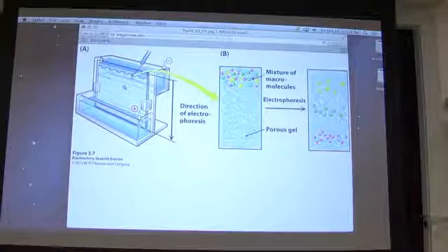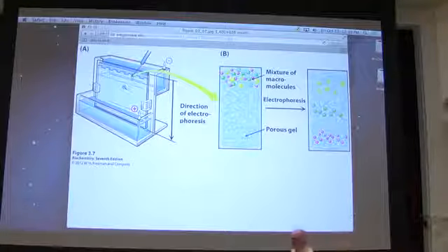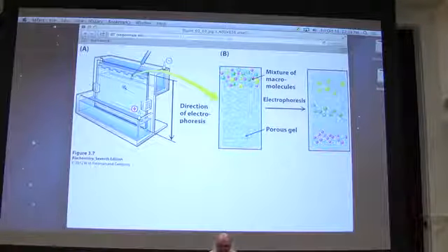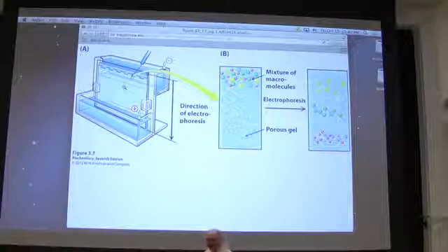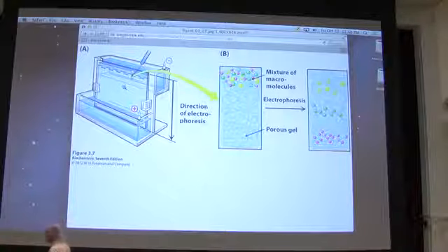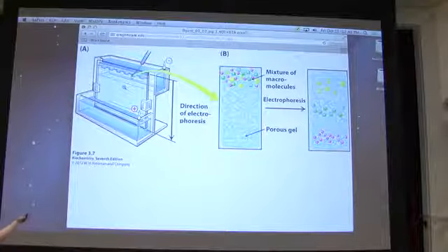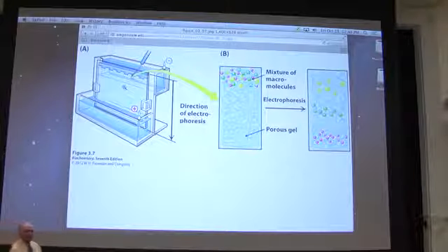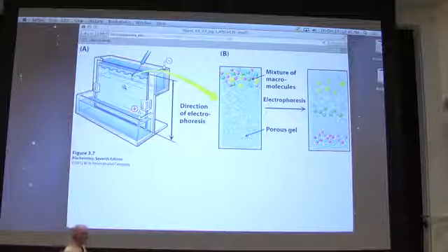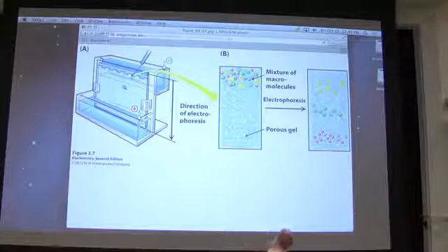Well, there's another consideration for those of you who hopefully are thinking about this. The other consideration is that proteins don't have a uniform negative charge, right? Some of them are going to be positively charged. Some of them are going to be negatively charged. Some of them are going to be uncharged. And if I put them into this mixture, just like I talked about before, and I put plus at the top, and I put minus at the top, and I put plus at the bottom, and I put my proteins right here, when I turn on the current, the positively charged proteins are going to jump right up here and stay on the top, and the negative ones are going to move, and the zeros are going to sit there and go, I don't know what to do. We're not going to separate things, guys. That's not good.